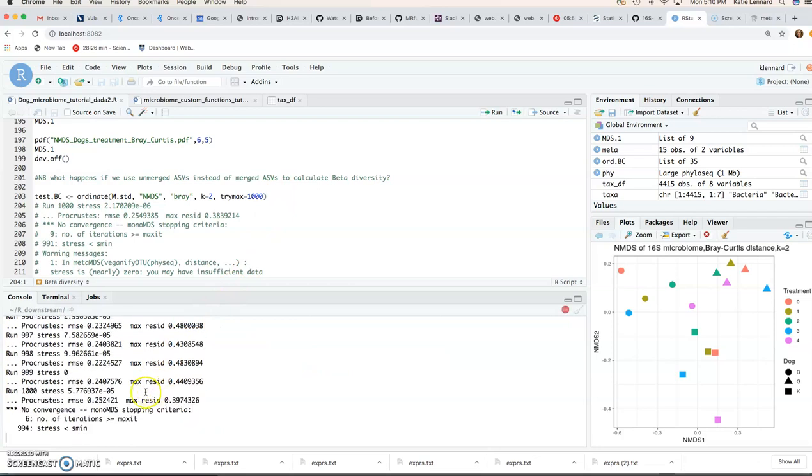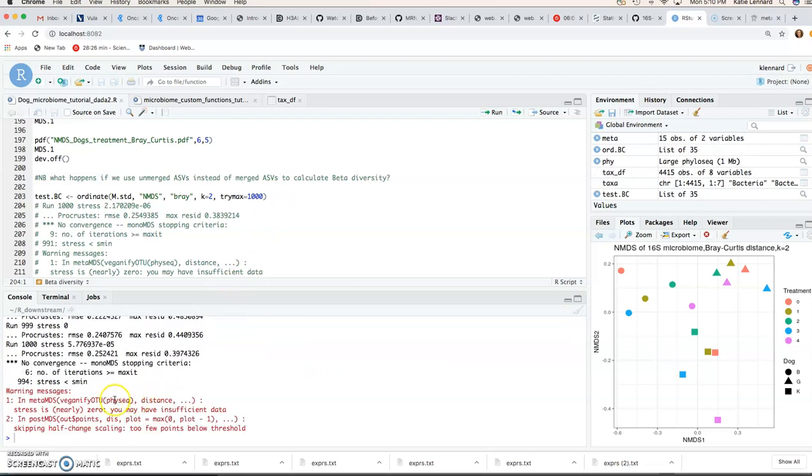we'll see it runs the iterations. But then it tells us that you may have insufficient data and that it couldn't find a solution. So it has no convergence.